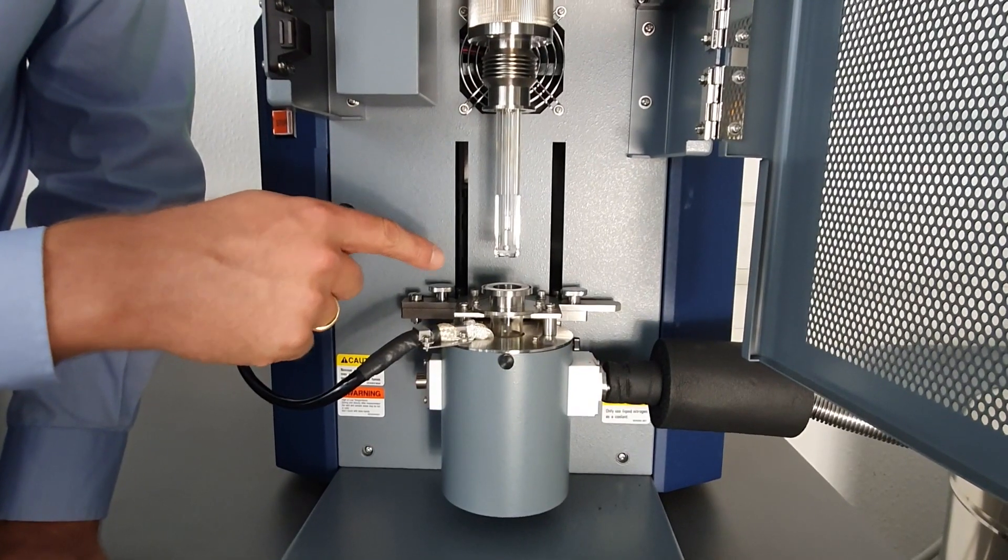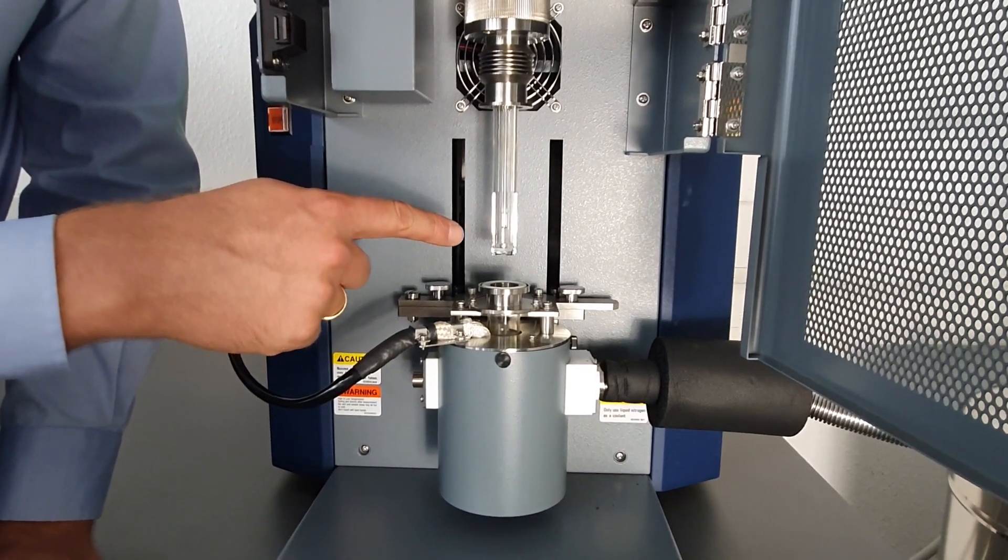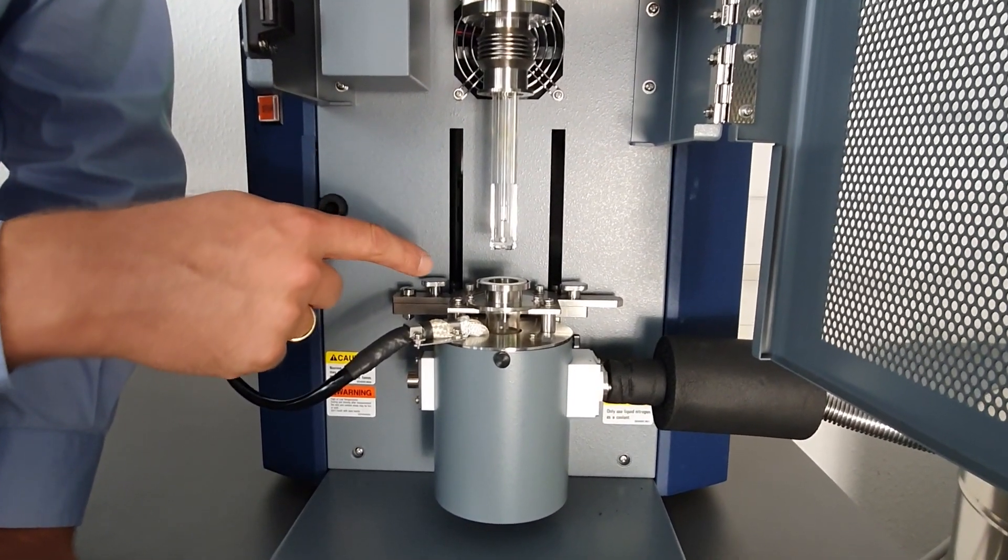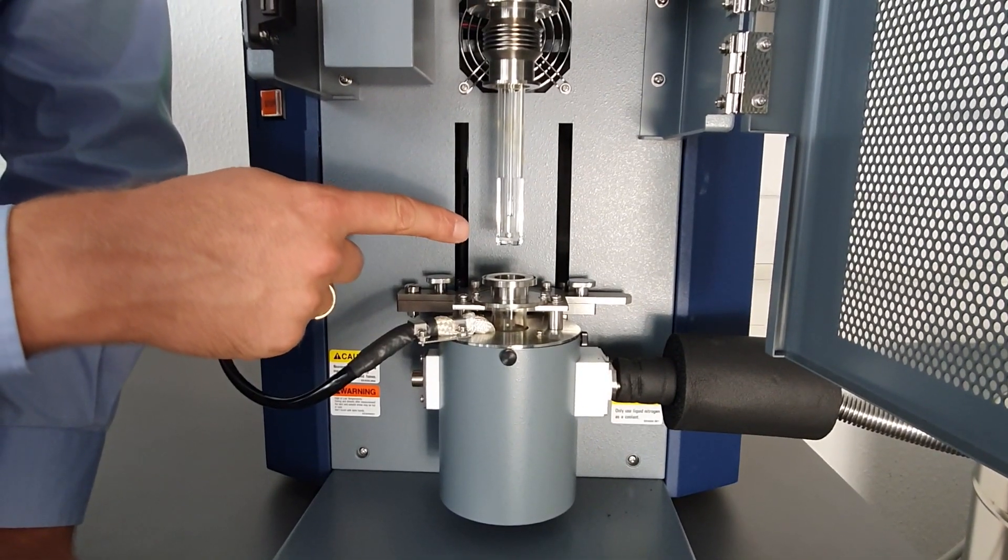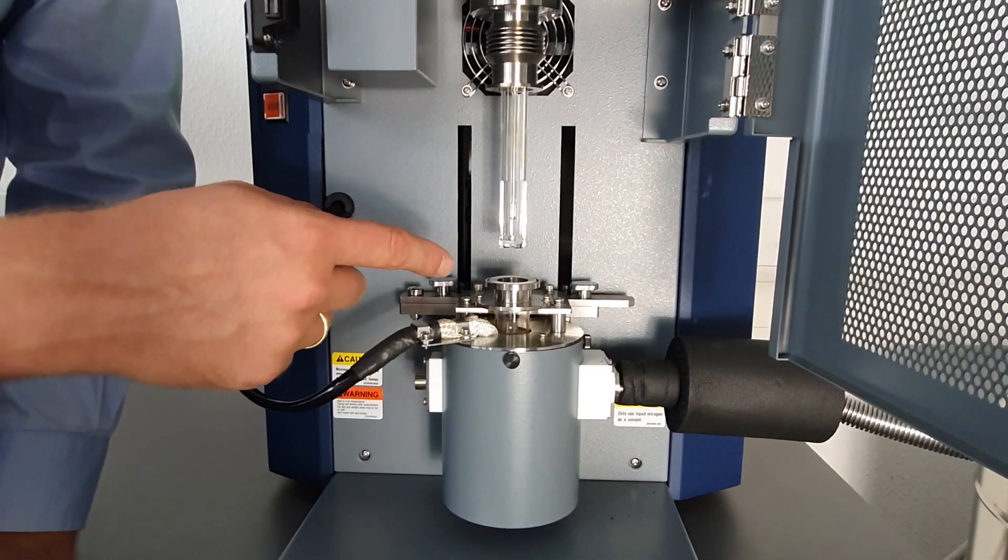Here you can see a typical sample holder and measurement probe for an expansion measurement. The sample holder and measurement probe is made of quartz glass and can be used, for example, to analyze some polymers.